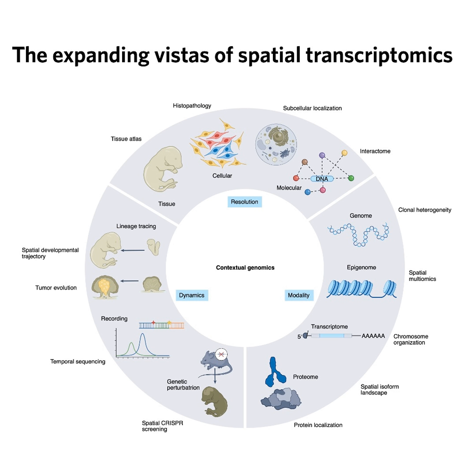Right. You mentioned the urgent need for standards earlier. Yes, it bears repeating. First, the immediate and widespread adoption of standardized reference tissues like that mouse olfactory bulb or the embryonic eye we talked about is absolutely necessary. We need them for rigorous benchmarking, for comparing performance fairly across all the different platforms and labs. Having everyone on the same page regarding quality.